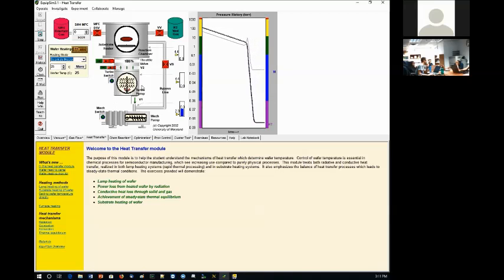All right, and now let's flow in some gas, like 100. These are nice exercises. We're going to set the substrate heater to some temperature, let's say 600 degrees. And then we're going to turn that on. The heater will be turned on. This is now going to read out the temperature of the wafer. So we're heating up the heater, and then that's heating up the wafer here.